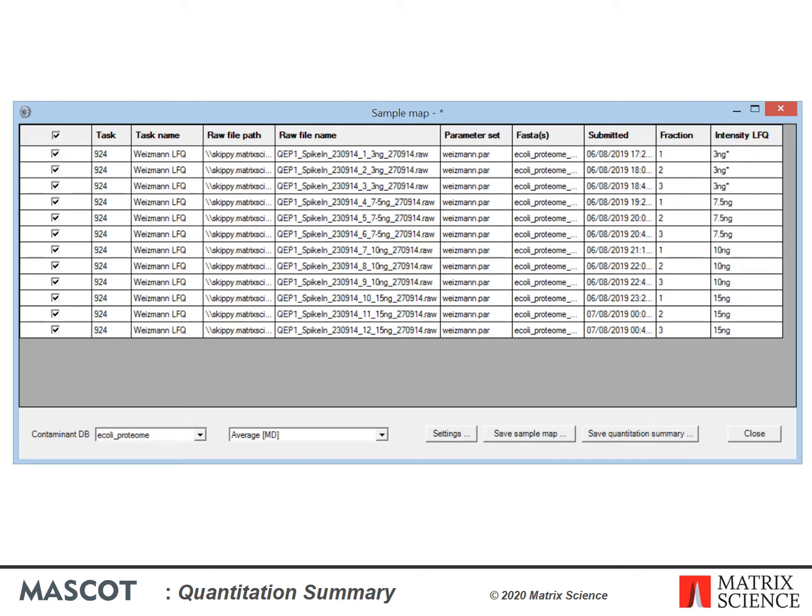If a sample is not fractionated, the fraction cells can be left empty, unless you want to use them to merge replicates by treating the replicates as fractions. In this example, there are two useful ways to fill in the two columns on the right that are used to identify the samples. As shown here, to merge replicates as if they were fractions. An asterisk indicates the reference or control sample, and the quantitation summary will include ratios relative to this sample.